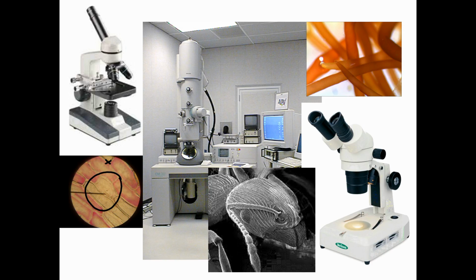Because when you zoom in, it's going to cut out part of the outside of the image. So if you're trying to look at this X here, and then you zoomed in to a higher power, that X would no longer be in your field of vision. So always use that pointer as like a middle part of the image you're looking at.